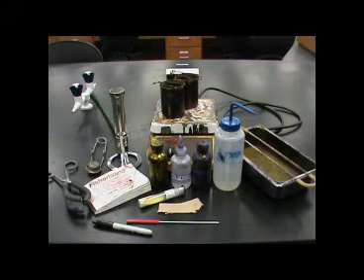The acid-fast stain is an important tool in diagnostics, especially for the diagnosis of tuberculosis. The acid-fast stain is a simple and easy method to determine the presence of Mycobacterium or mycolic acid-containing bacteria.